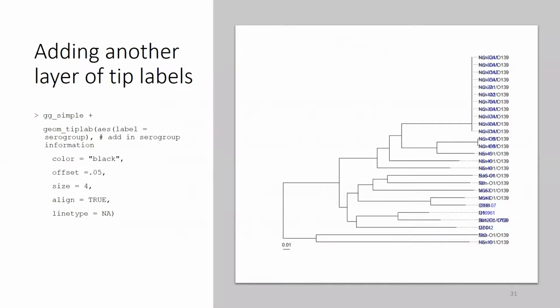So if you don't offset it, this is what you'll get. If you want to do this right away, you can gauge how much offset you actually need. Sometimes you need to play around with it. It could be a little tedious, but it works.